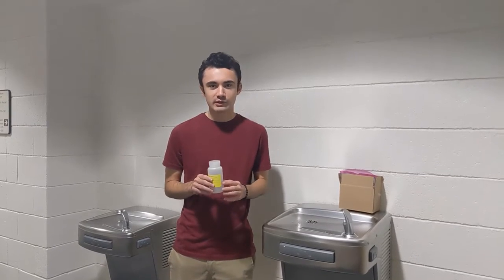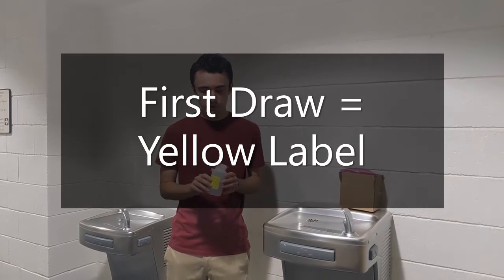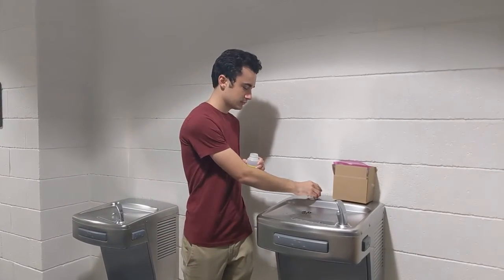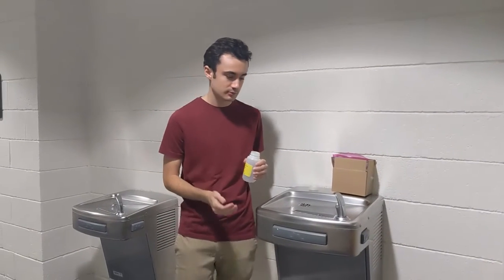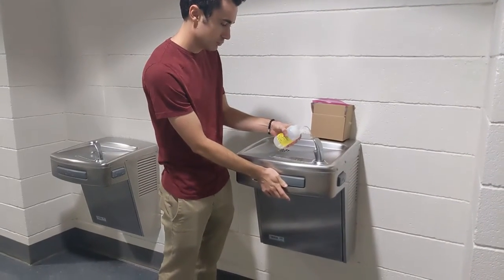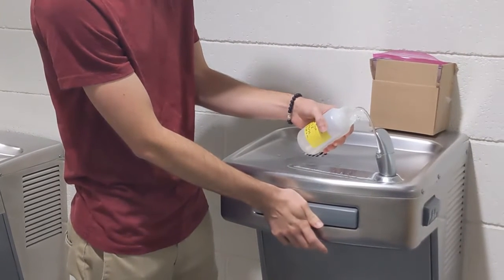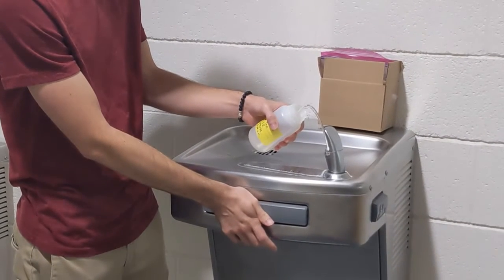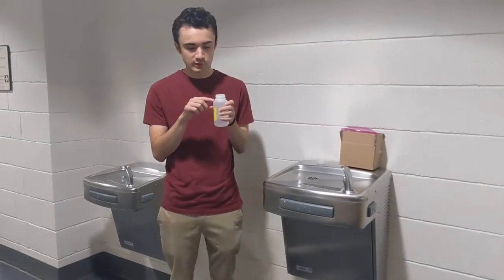We'll begin with the bottle with the yellow label. This is your first draw sample, which is before any flushing occurs. So unscrew the cap of the bottle and place it face down on a clean surface. And then you'll try to catch the water as soon as it comes out of the faucet. Fill approximately up until the neck of the bottle.